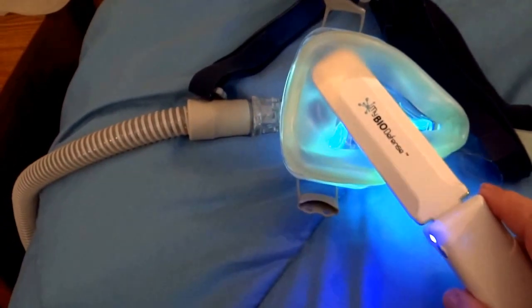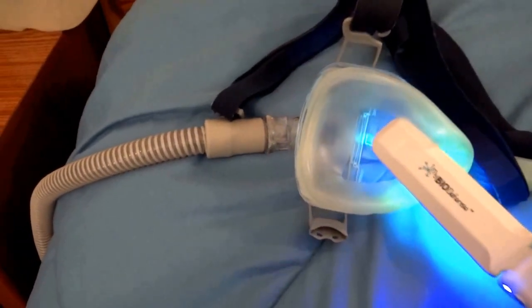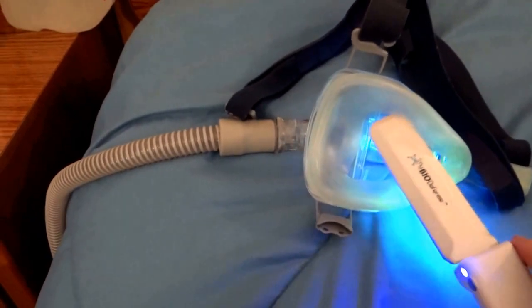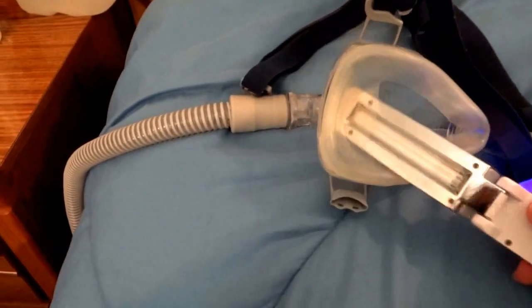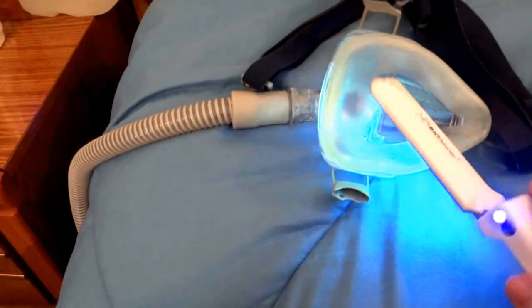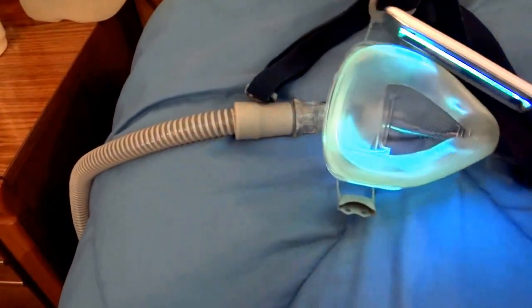I go inside the mask as well. Now I can't do it with one hand easily, but what I usually do when I turn it over is go on this side too. Then I use this side also.